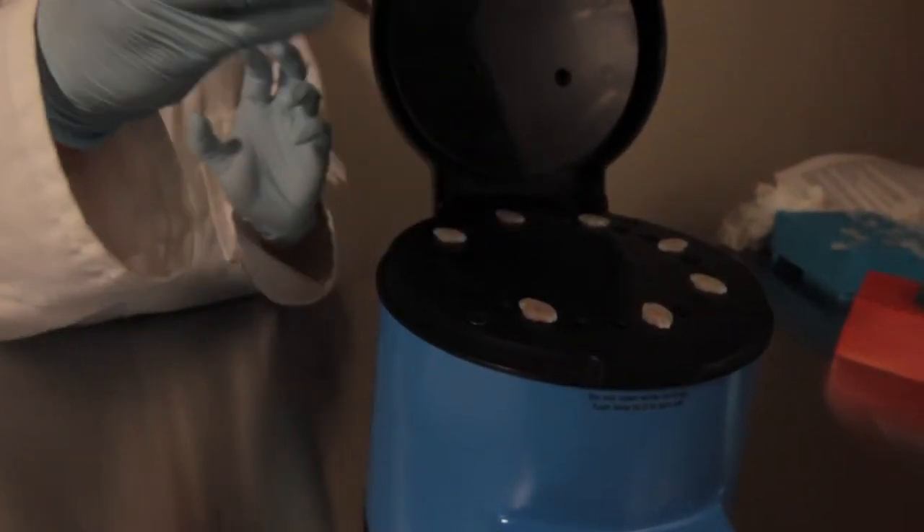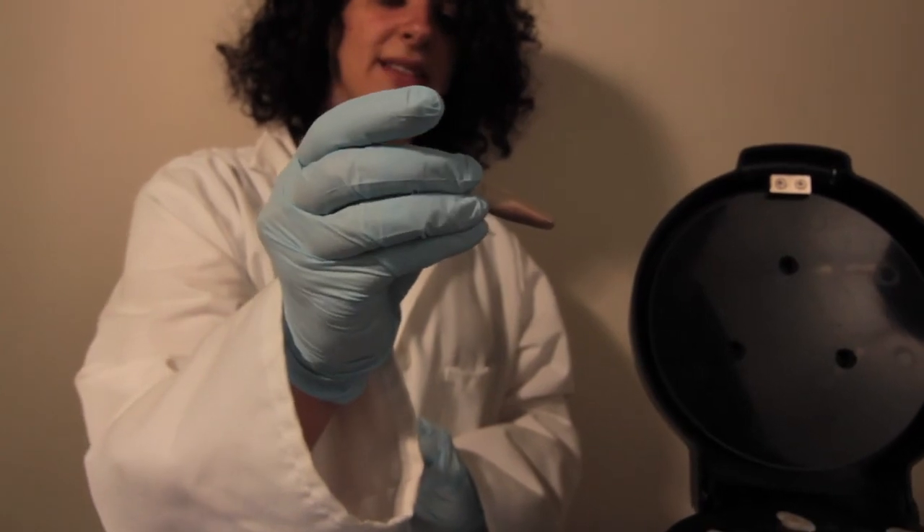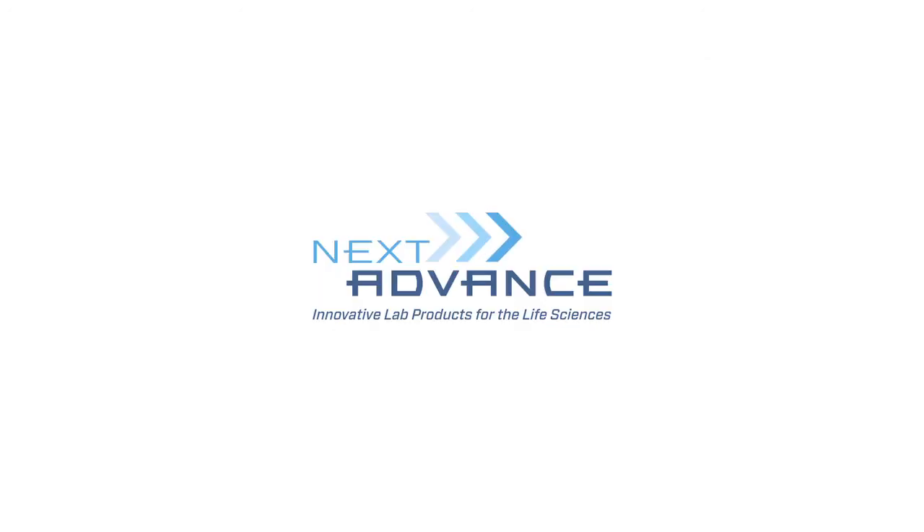Examine your samples. If you see unhomogenized pieces, place them back in the bullet blender and homogenize for another minute or two at speed 10. These samples appear to be fully processed. You can now proceed to the downstream application of your choice.